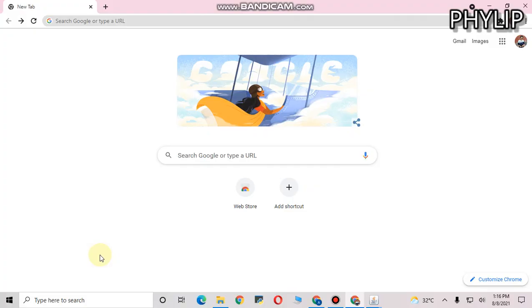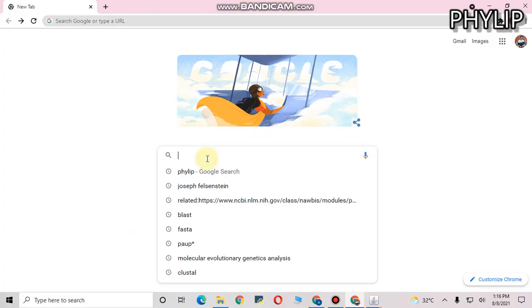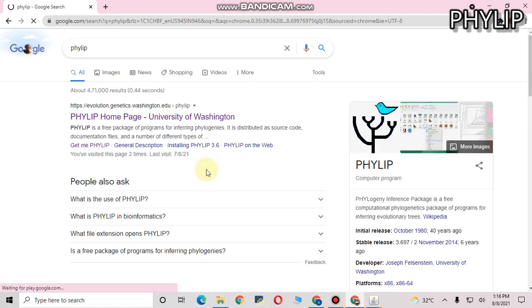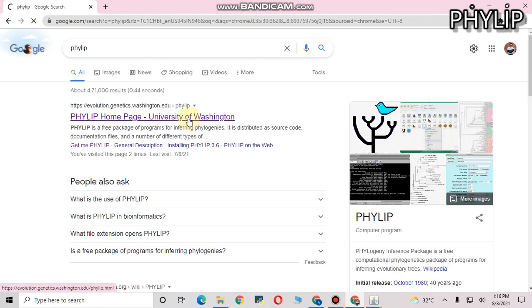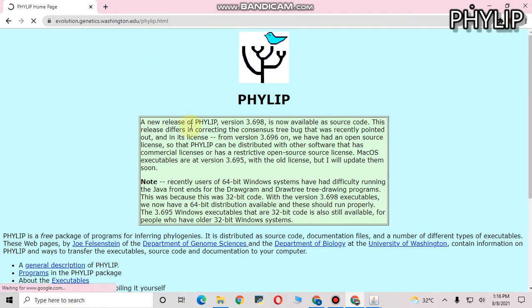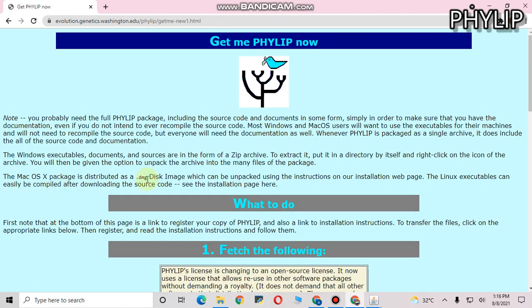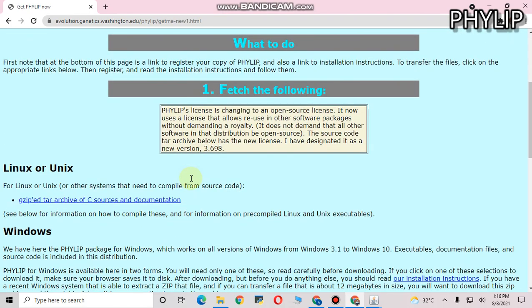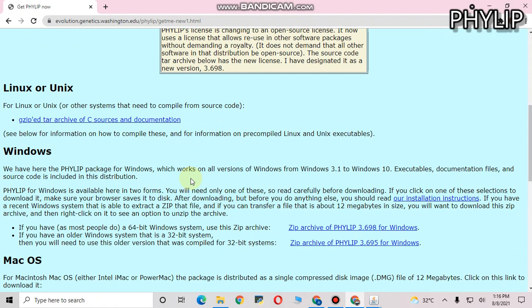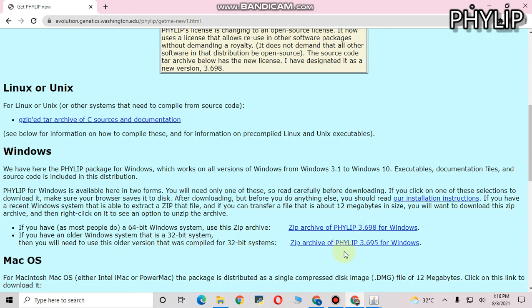To install this application, go to browser and search with the keyword PHYLIP. Then go to the first link provided by University of Washington. Here you find GetMePHYLIP. Click on this hyperlink. On this page, you will find zip archives for various operating systems. If you use 64-bit system, you can go for this link. If you use 32-bit system, you can go for this link. You can directly download the zip archive and get it installed in your system.